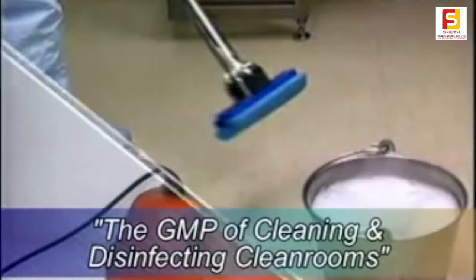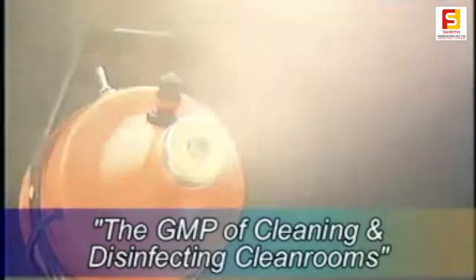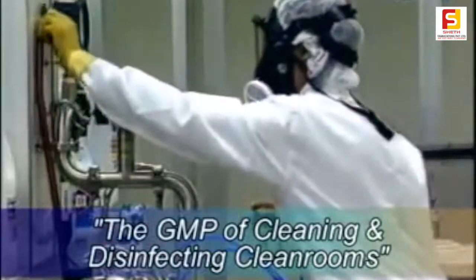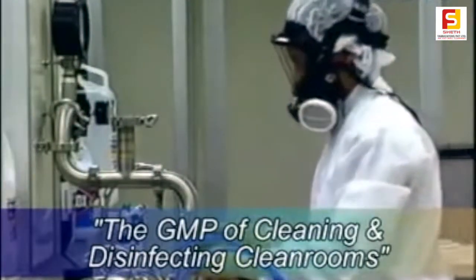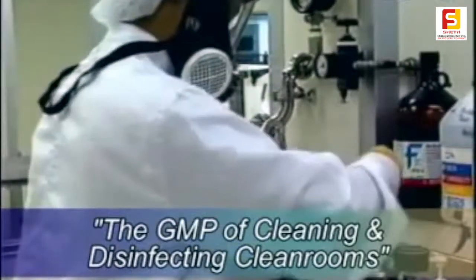SOPs may require periodic fogging of the cleanroom. This process takes place after the regular cleaning has been completed. The whole area is treated with a fine, decontaminating spray. As the fumes are generally harmful if inhaled, it's important that the SOP is carefully observed and that the operators are properly protected while preparing any of the solution as well as during the fogging operation itself.